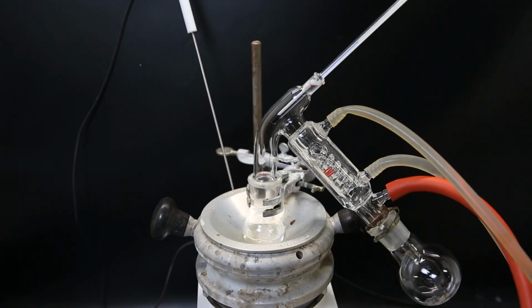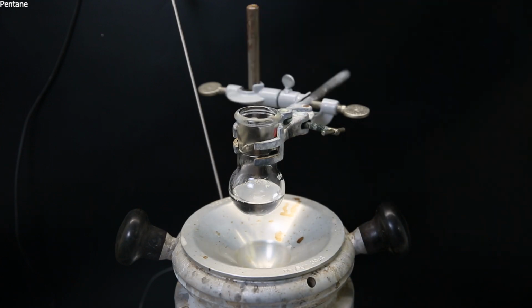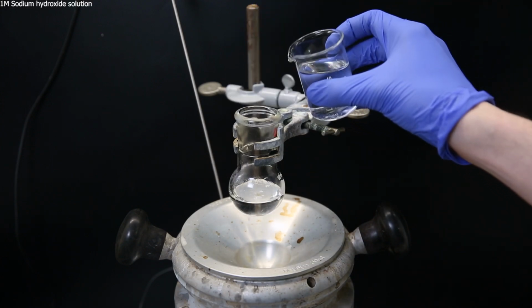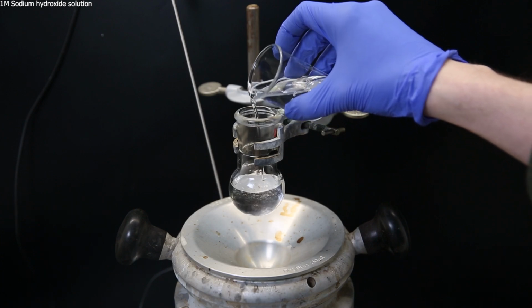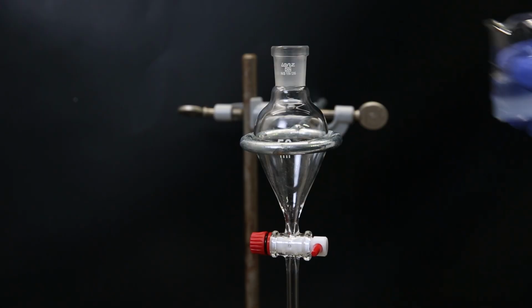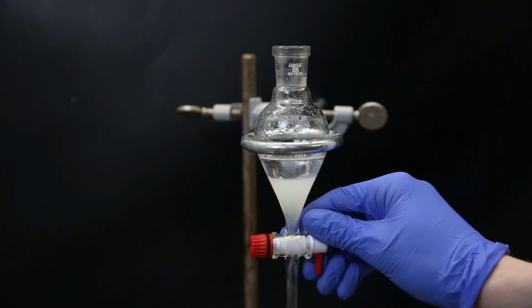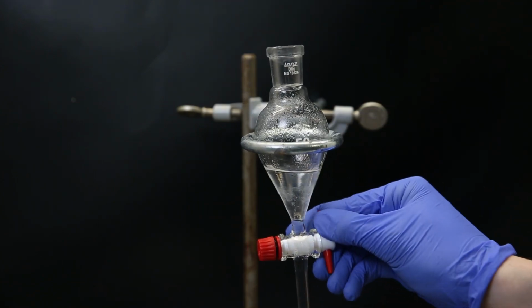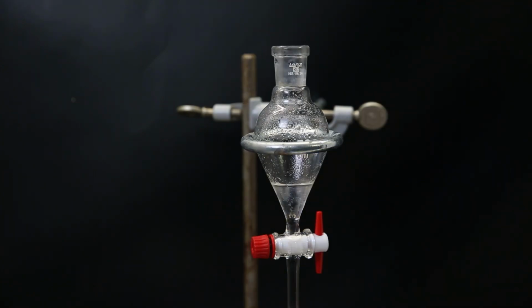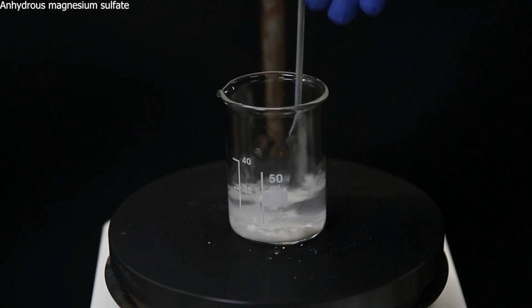When it is done, I distill off all of the ether, and then dilute the residue with some pentane. I then wash it with a 1 molar sodium hydroxide solution, which will react with all the unreacted thiophenol to form sodium thiophenolate. I move it all to a small separatory funnel and mix it around. I remove the water layer and wash the pentane layer once more with some 1 molar sodium hydroxide solution. I then take the pentane layer and add some anhydrous magnesium sulfate to absorb any remaining water.